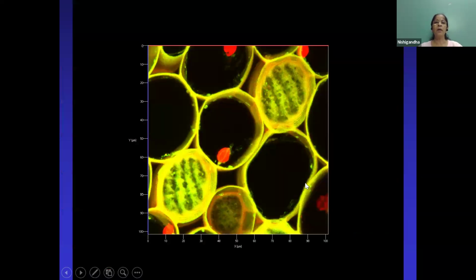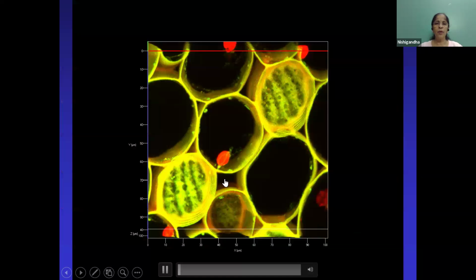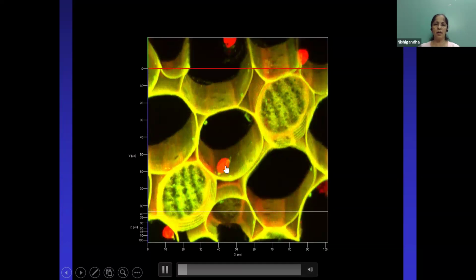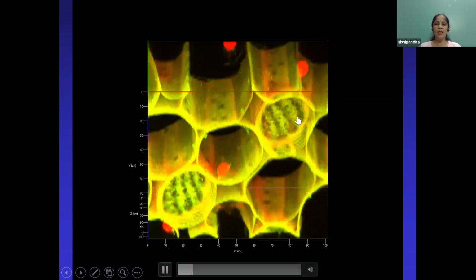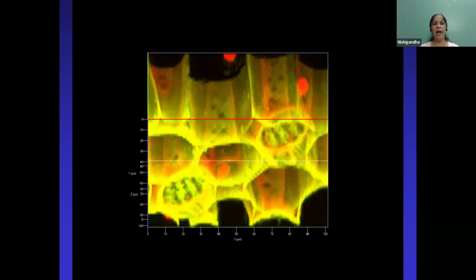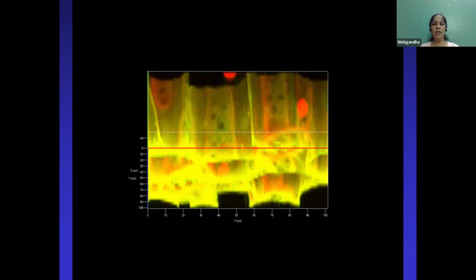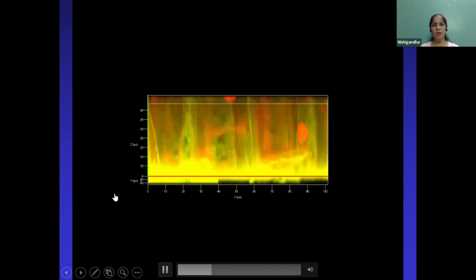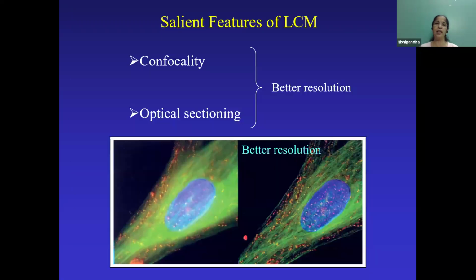And it's not just to view, but you can actually measure the distances, because when you have a 3D image like this, you can actually rotate it. So now if you see, this is at a higher plane or on the top, while this is somewhere low in the section. There are lots of things in the center which could not be seen earlier in the 2D image. Everything was looking like a blank, but there are even some pores in this. All this information is possible because we have a 3D image, and you can also make measurements along the X, Y, and Z axes to see what the distance between them is, and what its importance is. So that's how the 3D image gives you more information than any other image.